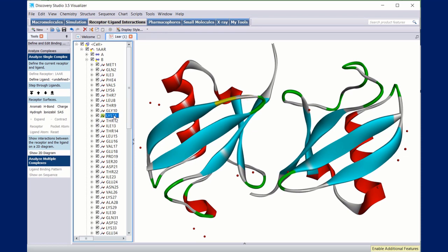If you select 11, see it shifted over here, 12 here, 13. If you want to select multiple, then you have to press Ctrl and select these. See, I have now selected 4 amino acids, and all these 4 amino acids have been displayed in yellow color. Likewise, if you want to select a particular amino acid, you can select it in this manner.